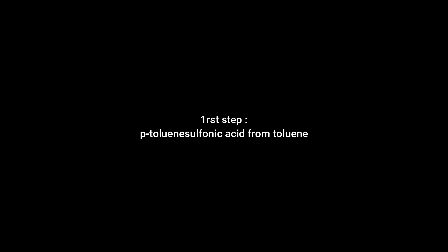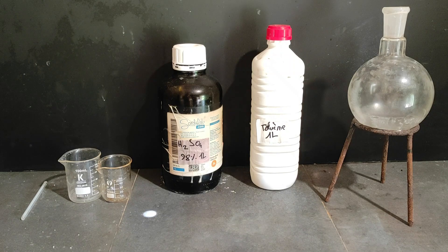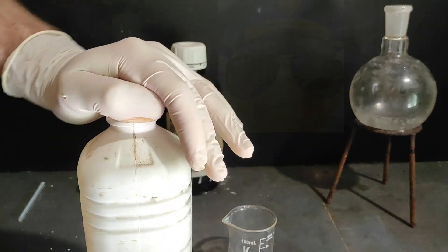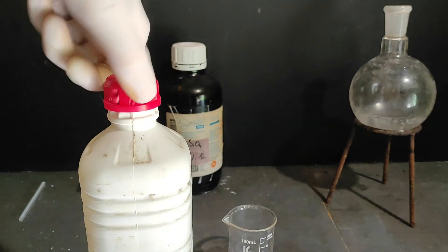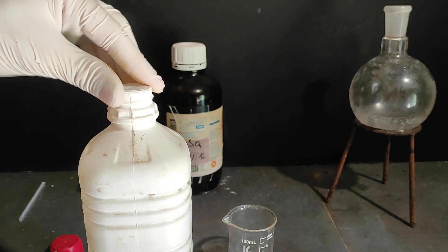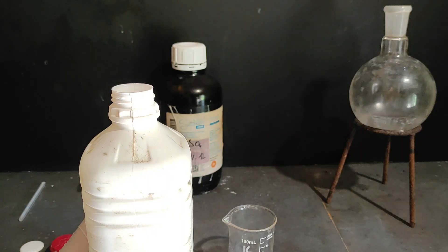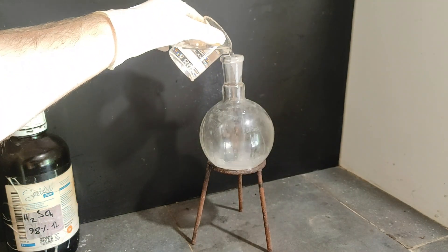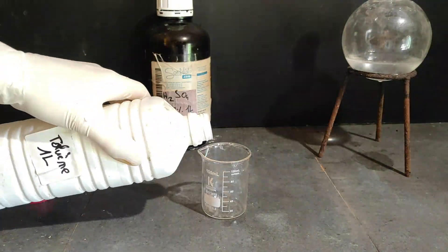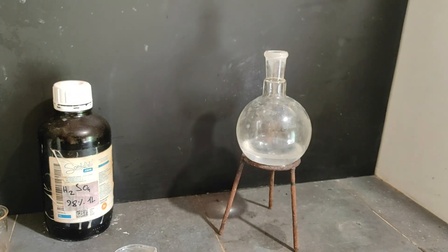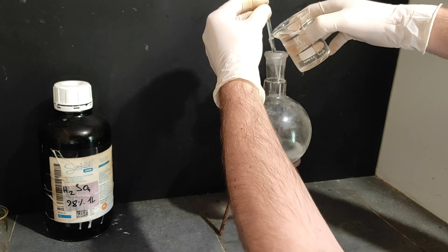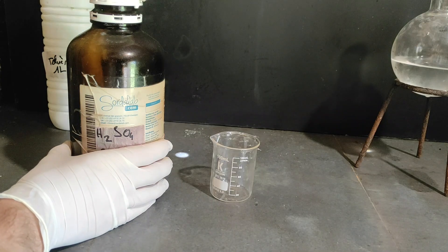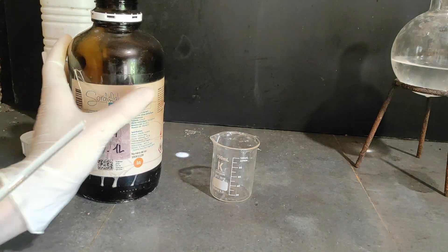Anyway, there was a lot of explaining, so let's just chill and start the first step now. We only need two reagents for this reaction: toluene and concentrated sulfuric acid. As always, be careful when handling chemicals, and especially concentrated sulfuric acid. We first start by measuring a whole 200ml of toluene and pour it into the 500ml round-bottom flask. Then we measure 70ml of 98% sulfuric acid and pour it in as well, but slowly of course, so that it doesn't heat up.